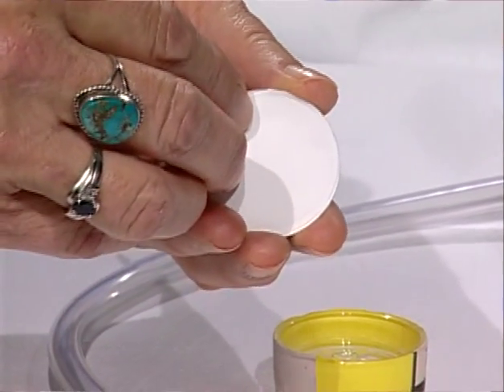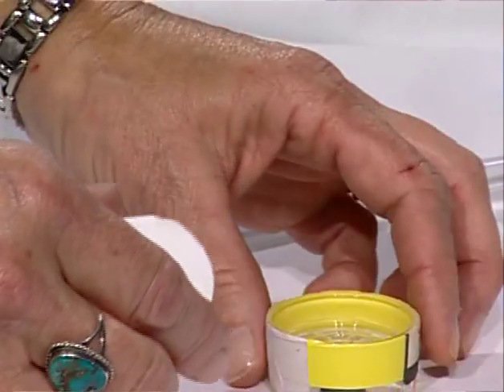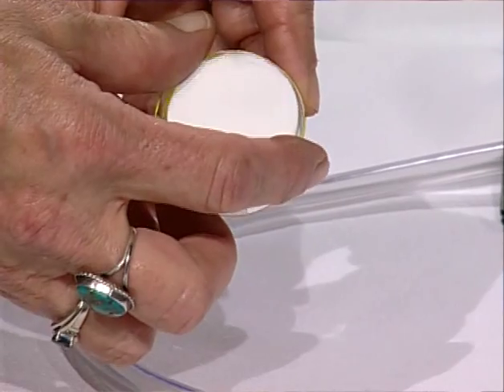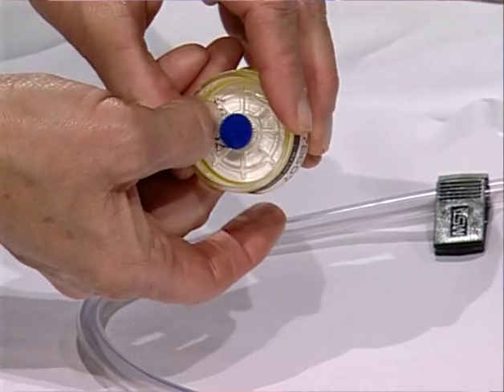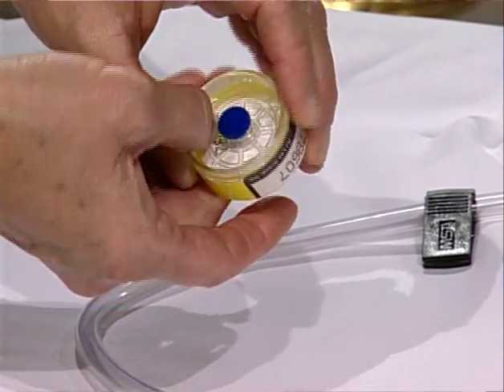So, if the orientation of the cassette within the cyclone is correct, dust will be collected on the filter. If the orientation is reversed, dust will be collected on the backing pad and the sample will be ruined. You have just wasted a bunch of time and money. Someone wore that pump 8 to 12 hours for nothing. The backing pad is not designed to collect dust, nor was it weighed prior to sampling.